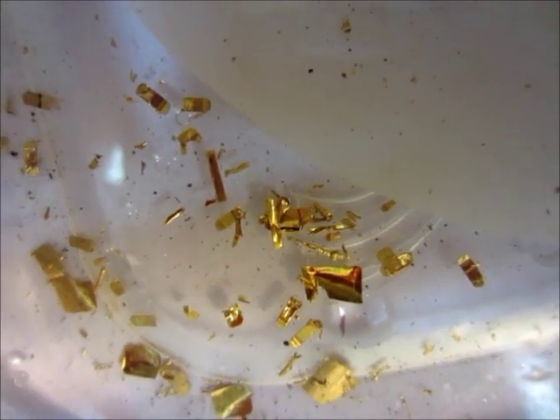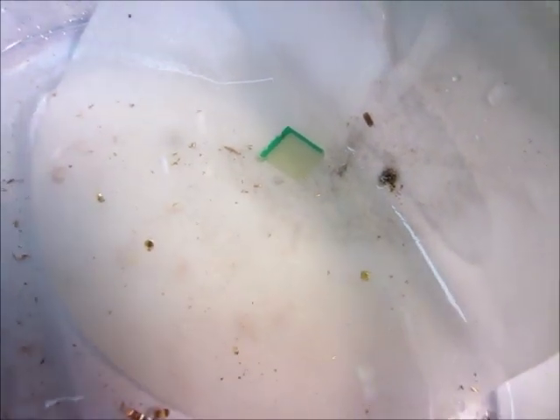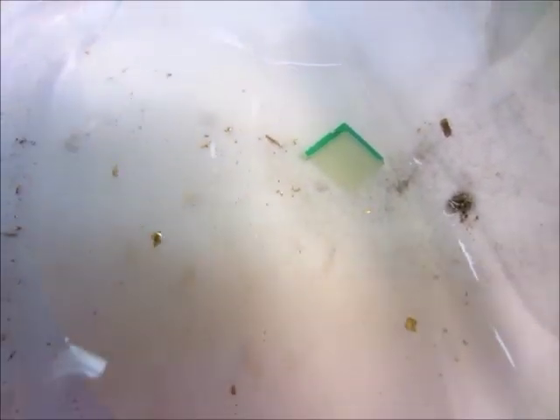It actually worked way better than I thought it would. Here's a better shot of the gold flakes — this larger piece here was from this component, which used to look like that. It's plated onto a little bit of copper, and the copper is the part that got dissolved away — or maybe it could even be silver, but it's probably copper — and left the gold behind.